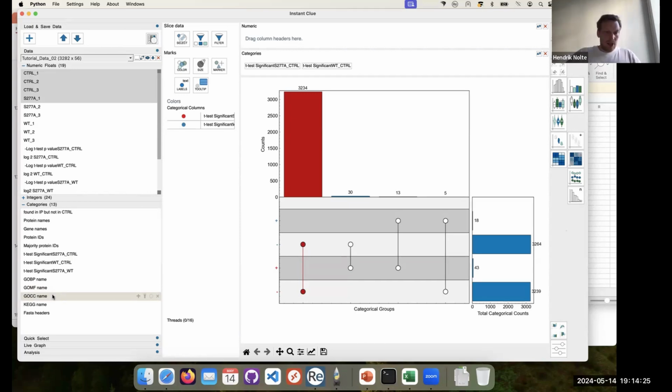These are categorized or hierarchical annotations of genes that are divided into biological process, which is handled here as BP, molecular function, and cellular component. And cellular component, for example, offers information about where a protein or a gene might be located. And we can use that actually to find, let's say, mitochondria proteins.